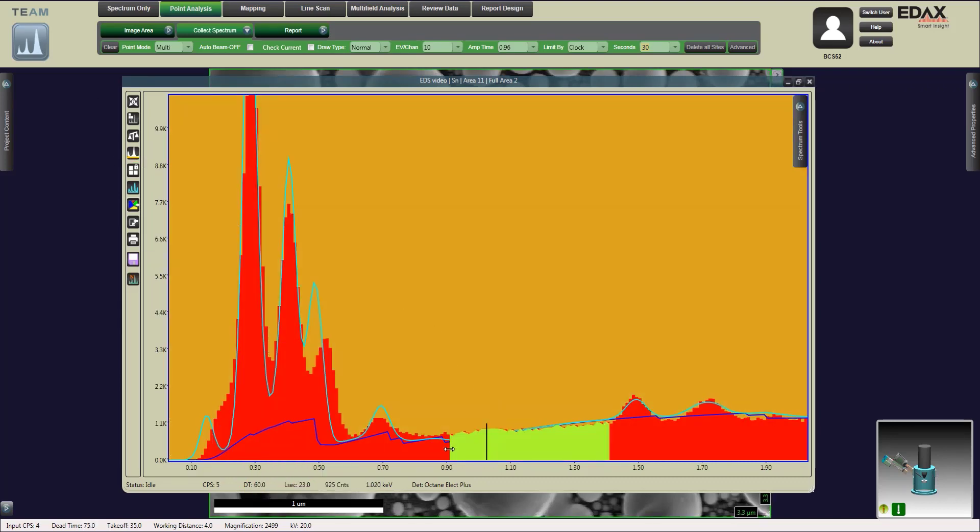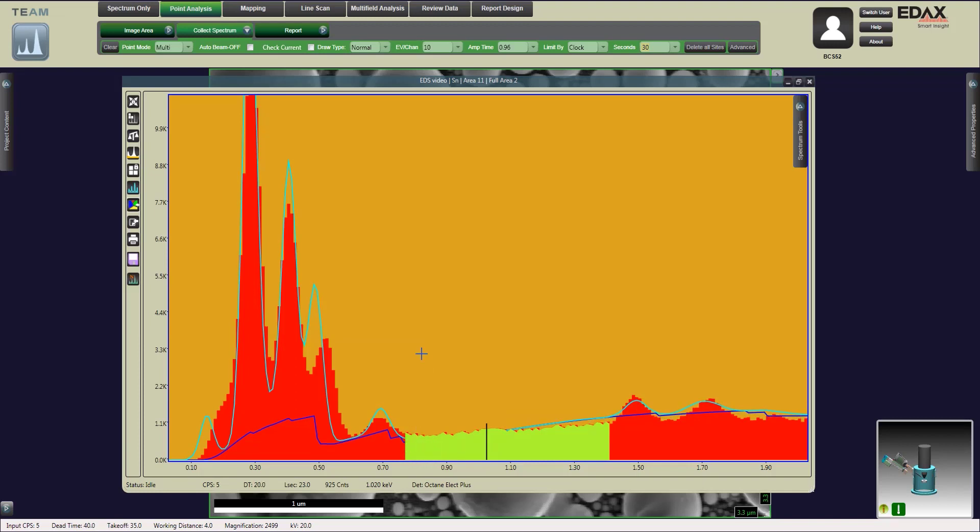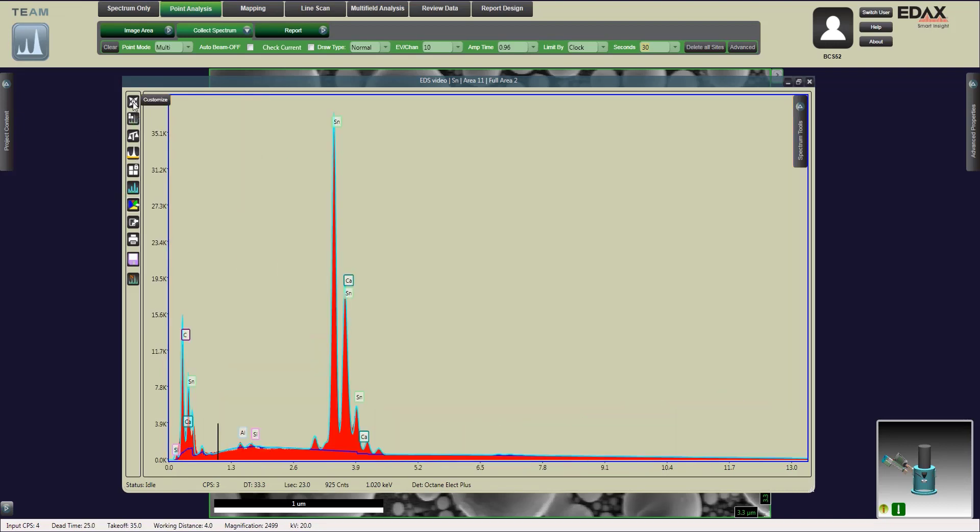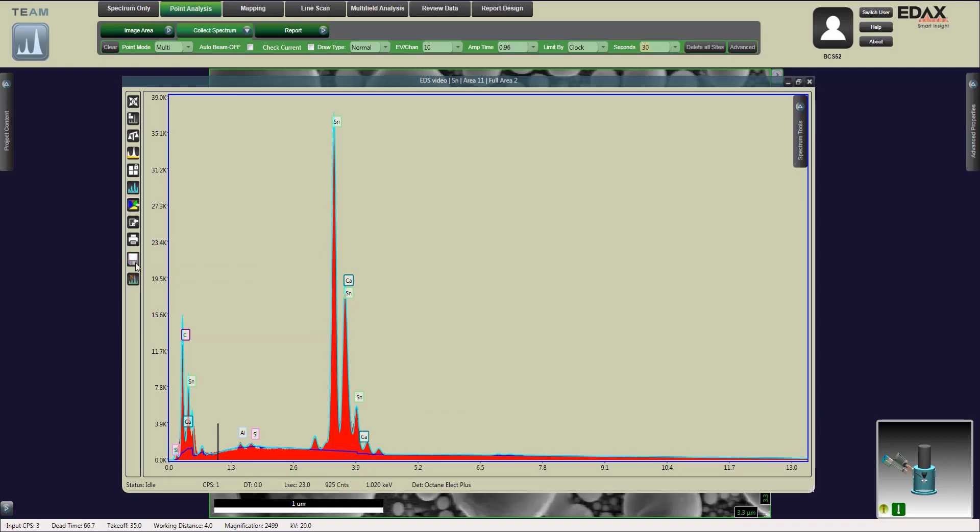I'm going to adjust the background slightly. Once we change our elements, we're going to select our save button to lock in the elements for our report.